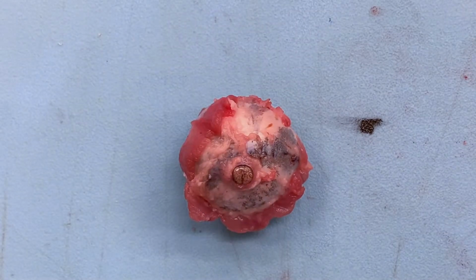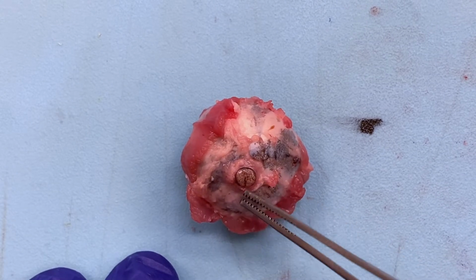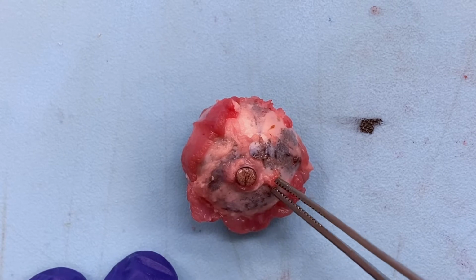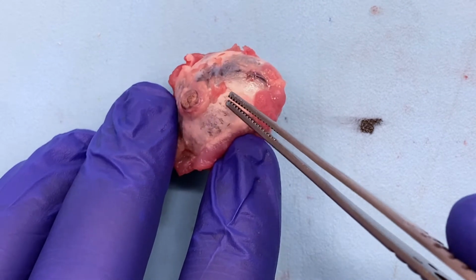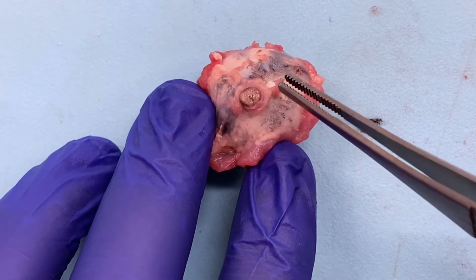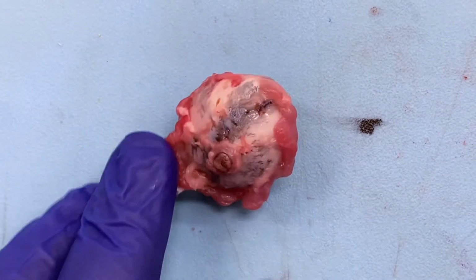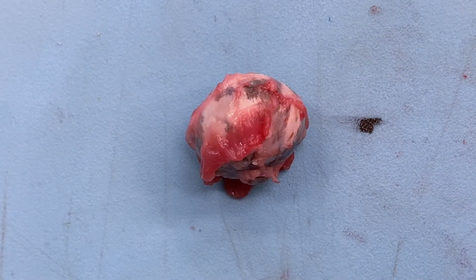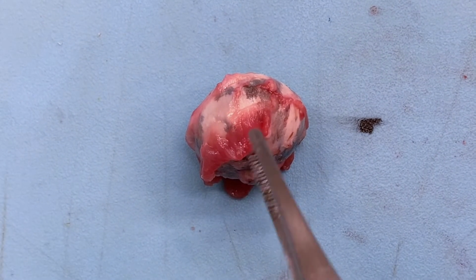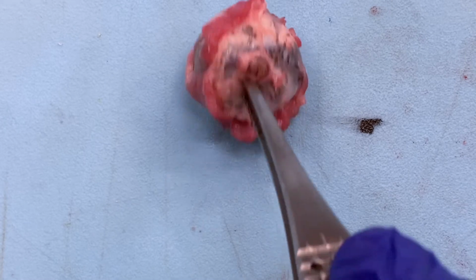So there's two key features we can use to orient these specimens. Posteriorly, we notice there's a posterior ciliary vessel, which is going to be kind of inferior to your optic nerve on the medial side. And we can say that little structure there looks like a vessel. That may be it. You might not often see these on the specimens you receive in your surgical pathology lab, so it might not be as helpful for orienting, but it's something to look for. Additionally, your orbit muscles can be helpful for orientation. So medial, lateral, inferior, and superior rectus muscles look very identical. The main orienting factors are going to be your obliques. So we should have a superior oblique and an inferior oblique.